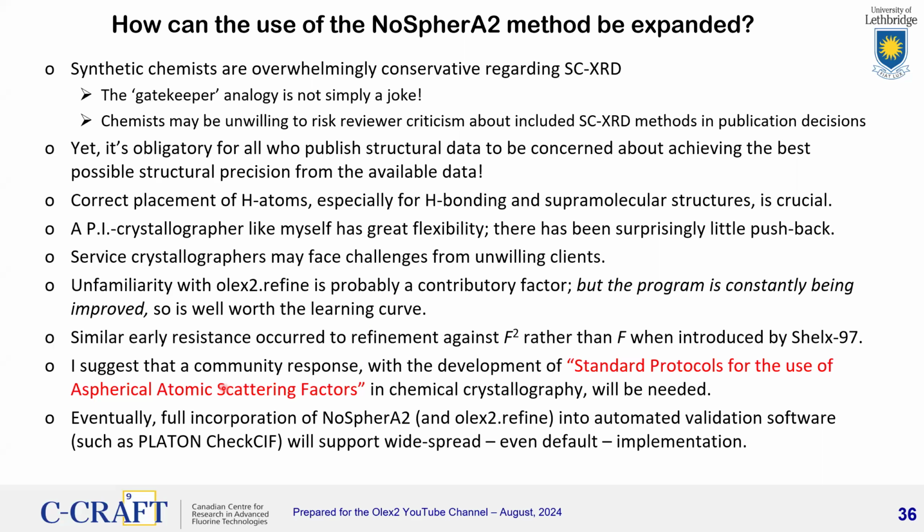I do think a community response will be needed. I think there should be a development of some sort of standard protocols for the use of aspherical atomic scattering factors, independent of which software you use per se, but that users can point to those protocols and say, I've met the protocols, and that should lead to full acceptance of their results.